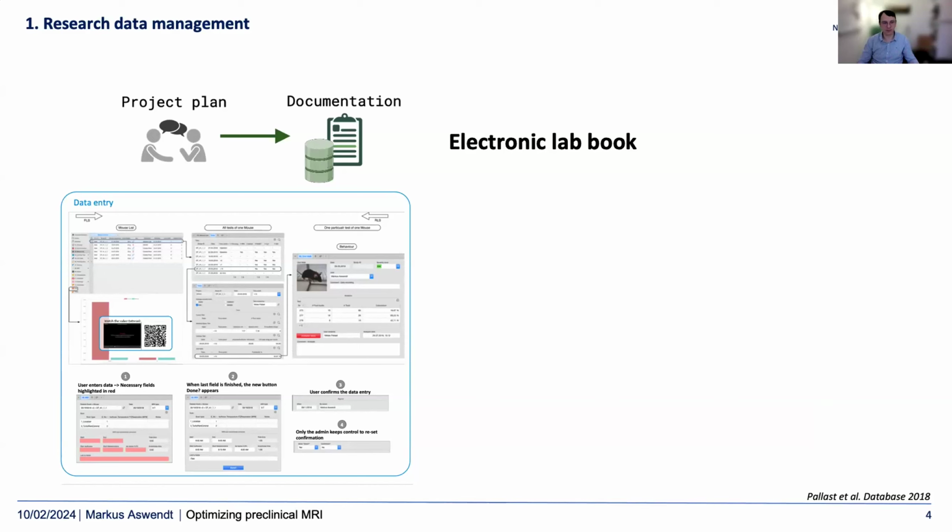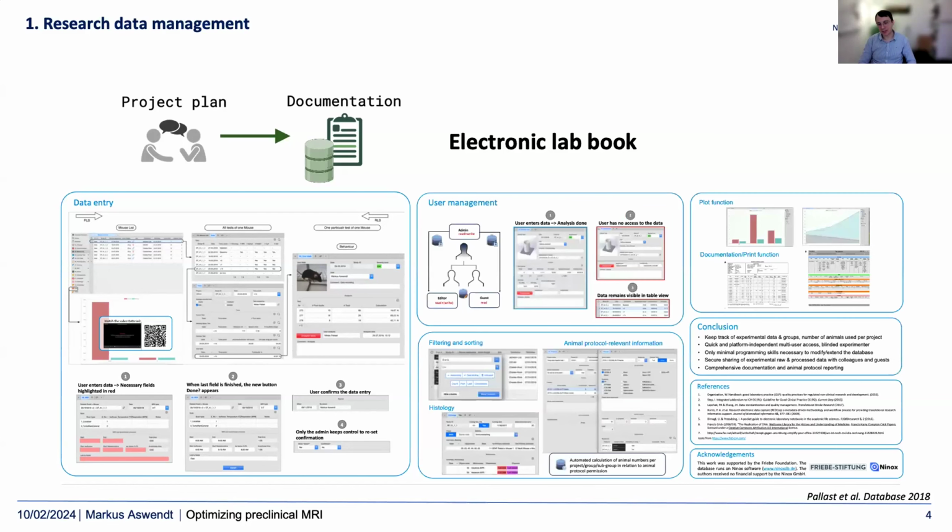And this is all electronic data, so you can only record it in an electronic database and not handwritten. And this database has a lot of nice features, which you know from other databases, like different user management ways. You can block, you can make blinded experimentations so that people don't see what they should not see, for example, if it is a treatment group or not. You can have statistics on that and so forth.